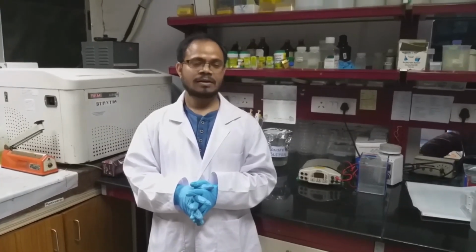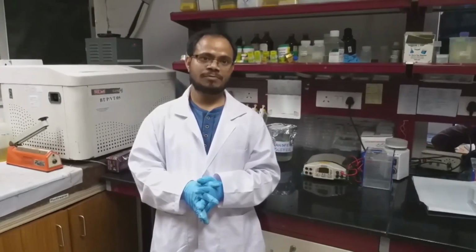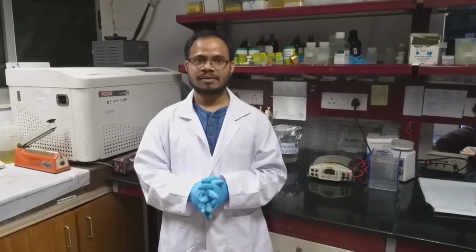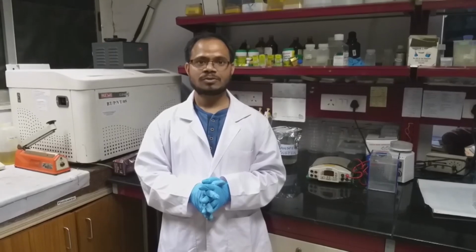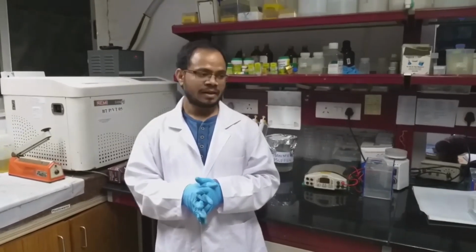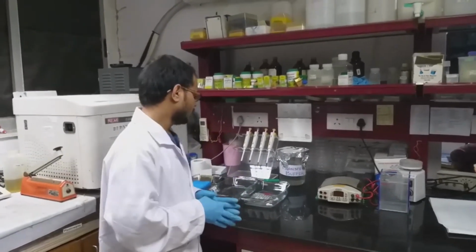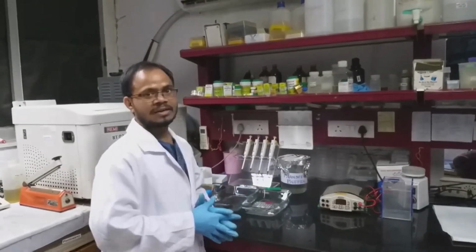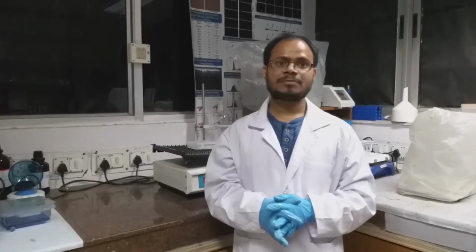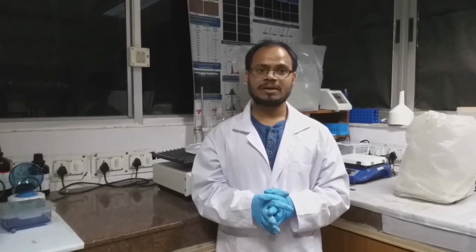Also, while handling the instrument, there is a possibility of electric shock, so we need to use gloves at that time too. After finishing the transfer, clean all the apparatus properly and dry it for the next use.